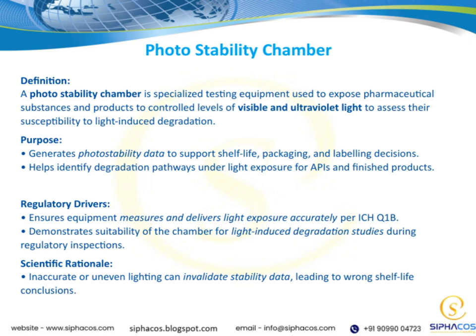The primary purpose is to generate photostability data that support key decisions about shelf life, packaging, and labeling. Essentially, it helps us predict how products will behave over time when exposed to light. It also helps us identify the specific degradation pathways that might occur under light exposure, whether for active pharmaceutical ingredients or finished products. Moving to regulatory drivers.